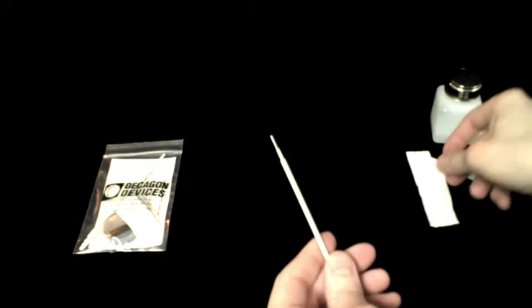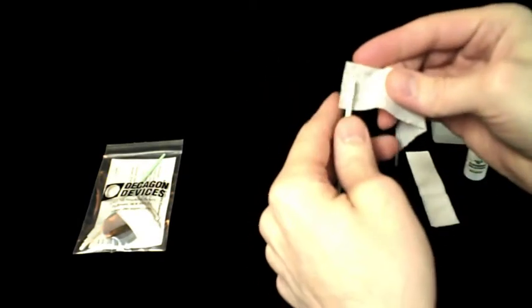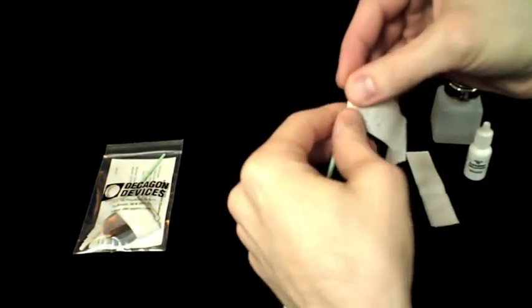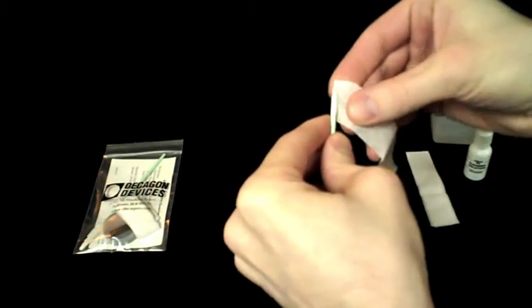Next, wrap a new kimwipe around the end of the thin plastic rod from the cleaning kit and moisten it with Decagon cleaning solution.